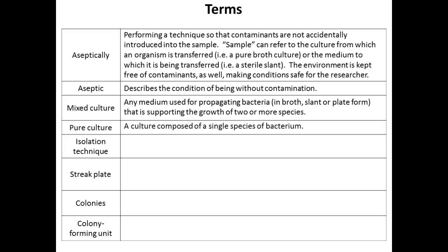A lot of times that's what we want to work with, right? Because we want to know our results are from that 1 organism, not is it this one or that one or whoever happens to be in there. Sometimes we start out with a mixed culture like what you have today. We purposely mixed 2 organisms in that tube for you today. You need to be able to separate those out to study them individually as pure cultures.